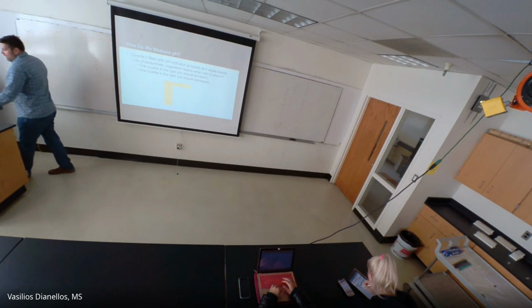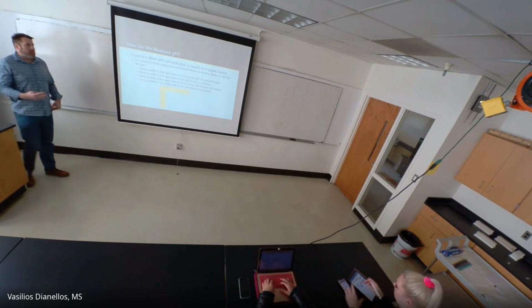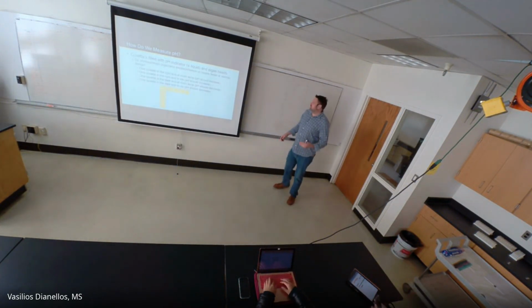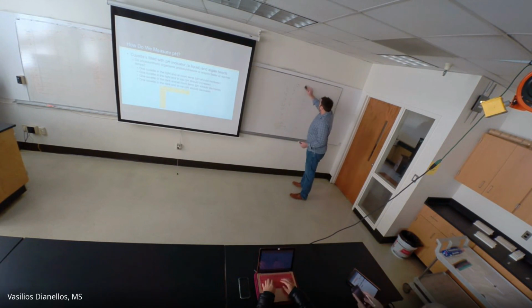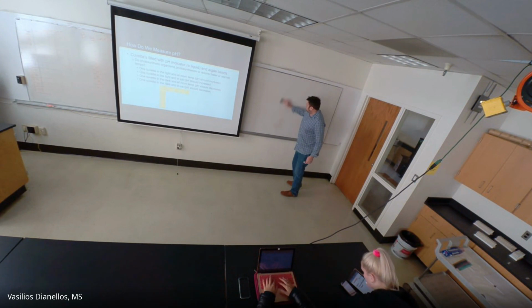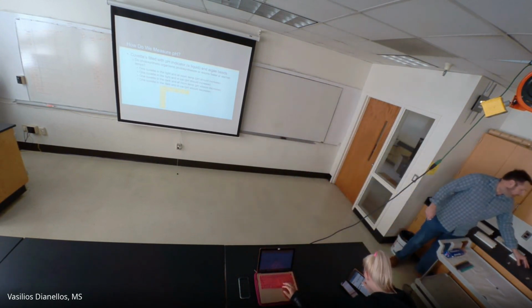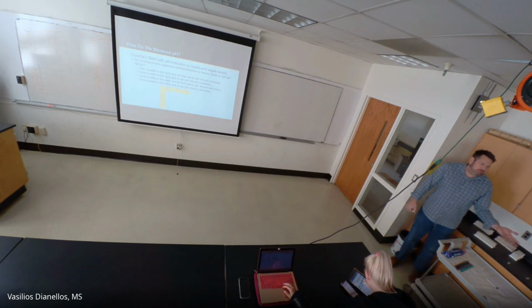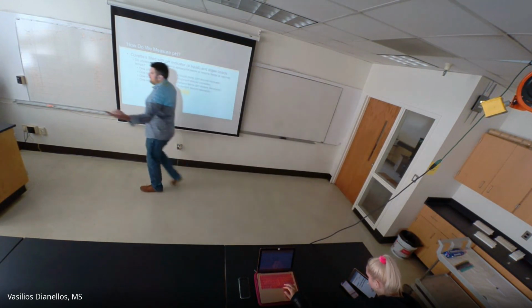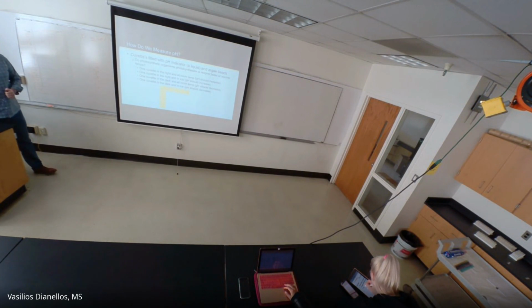Pretty simple. The next one's the most complicated one we have, I think, because it's essentially 2 experiments wrapped up into one. We're going to look at photosynthesis and see if things photosynthesize faster at warm temperatures or cold temperatures. So one of them is going to be in room temperature, just like this. One is in room temperature under a lamp. Another one's going to be in an ice bath. Make sense? So again, you have 2 of them that you're going to put in the light for photosynthesis, 2 of them that you're going to put in the dark for respiration.